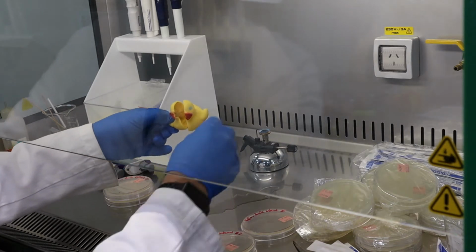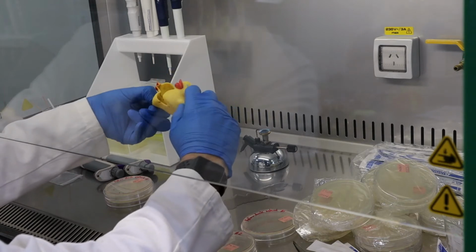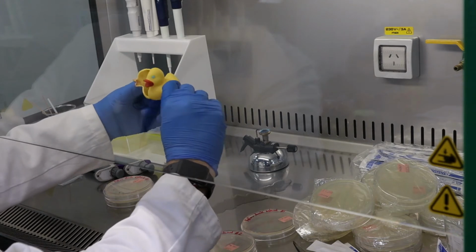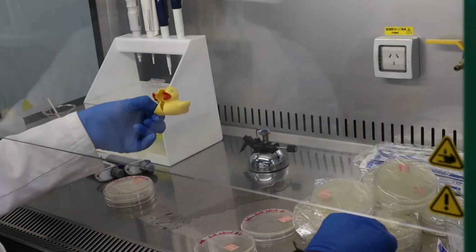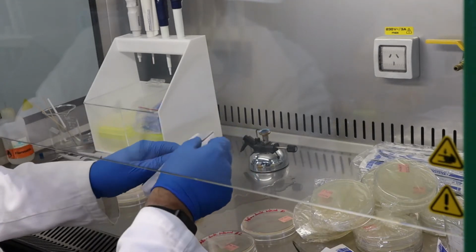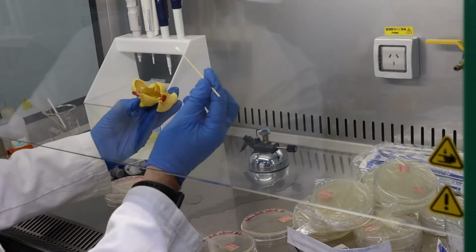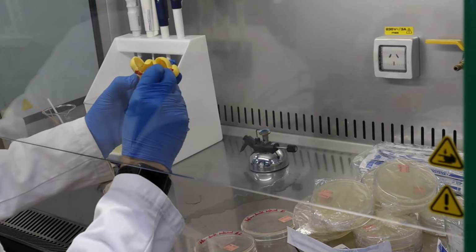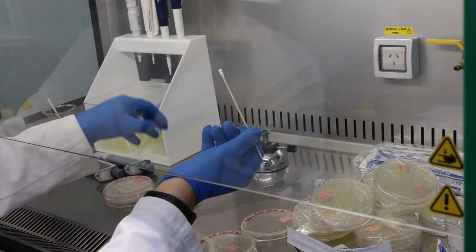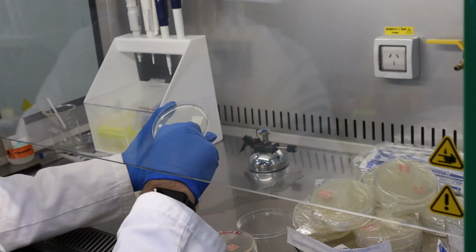So that is really quite concerning, because I've been holding this for about the last 20 minutes and none of this material, apart from a little bit of water, came out. So I'm going to take the internal surface of this. This definitely looks like a biofilm, just like the academic article said. You can see all that in there. Yuck. We will swab this onto the Petri plate and we're going to see what's going to grow.